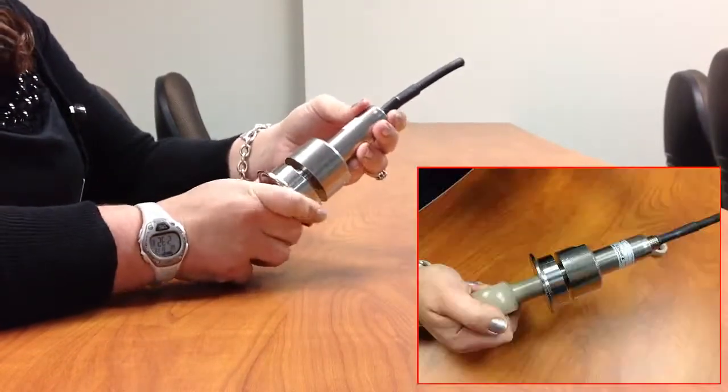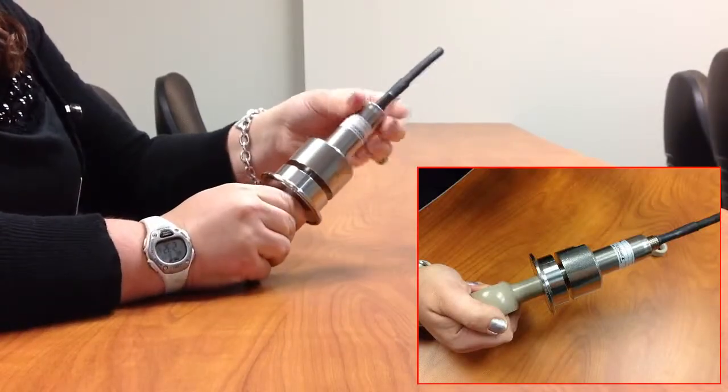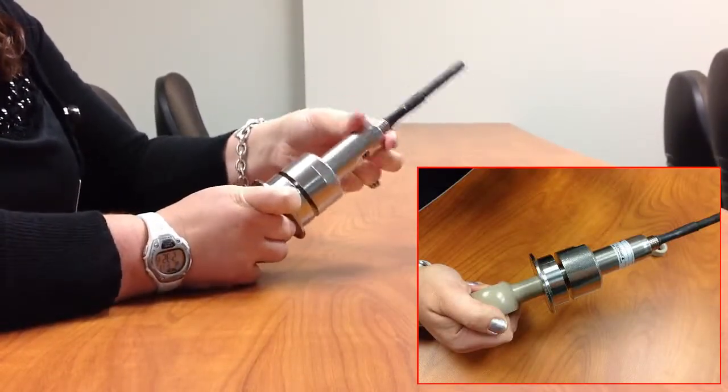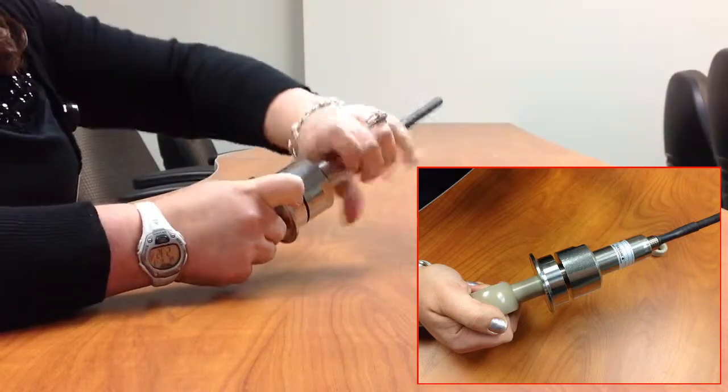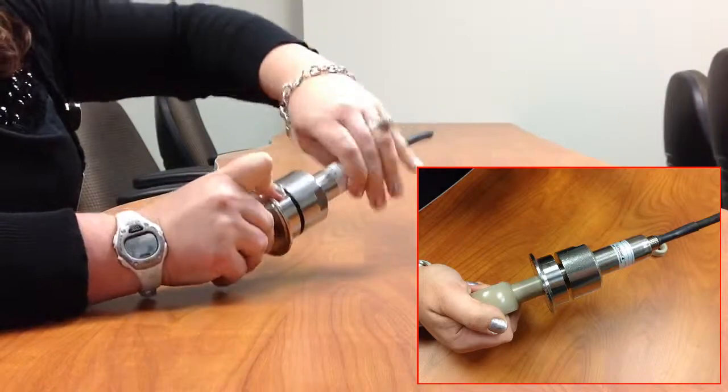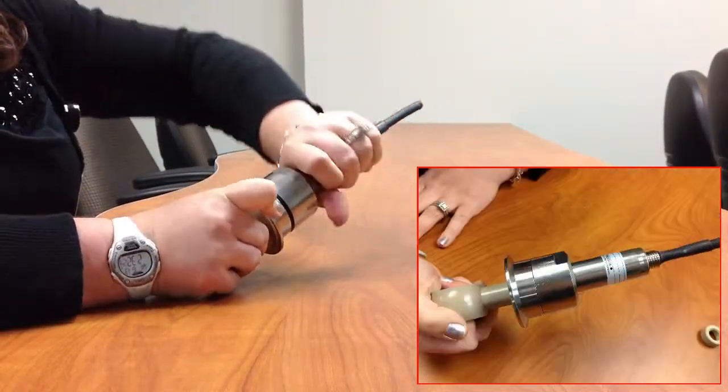The first step, you need to thread the back end of it in. And you know you've done it correctly because there should still be a gap between the top piece and the bottom piece when you do it.